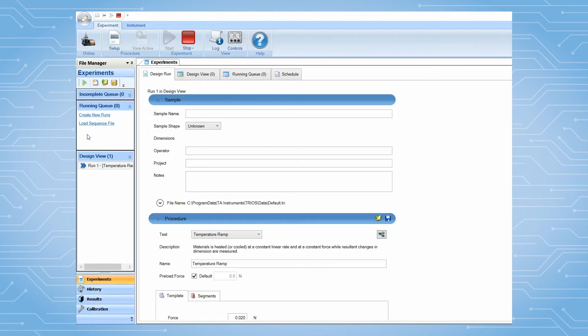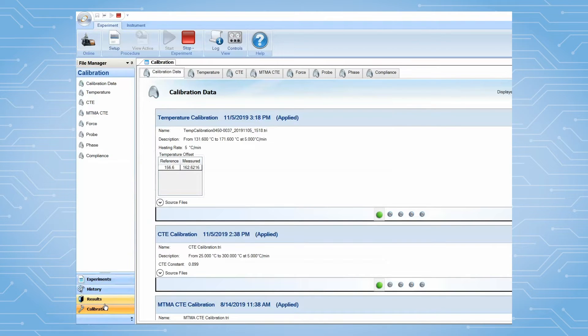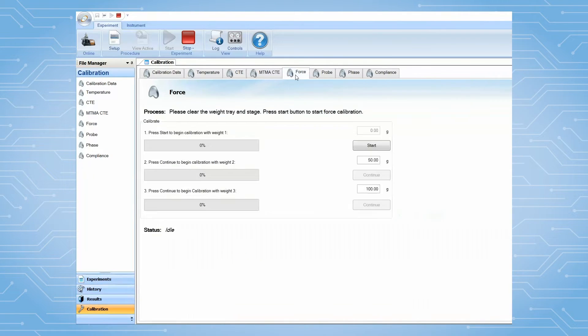You can also calibrate force from the TRIO software by going to the file manager calibration panel and selecting the force tab.